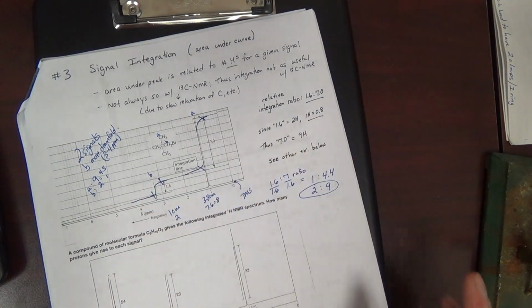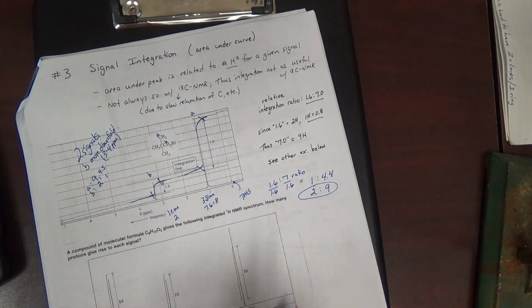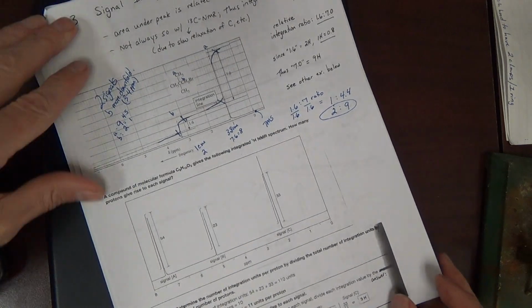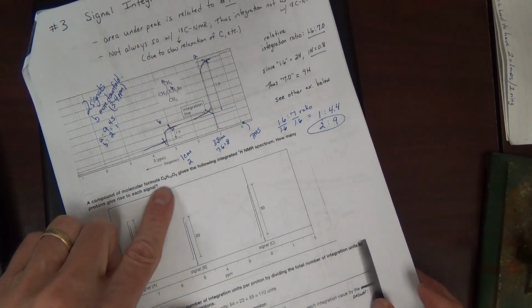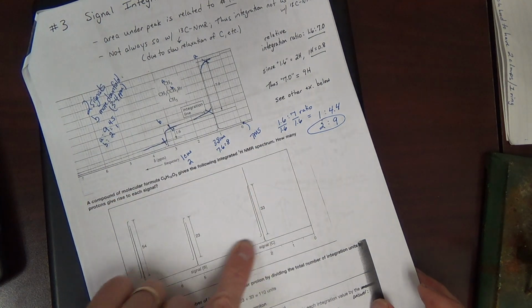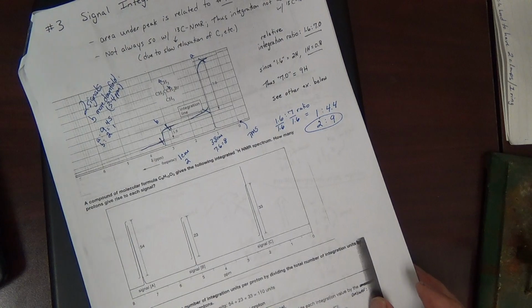Now that was an intro to integration. As we go along, we will do more and we'll approach it differently and try to fill in the blanks here. Now there's a problem here to work. A compound of molecular formula this gives the following NMR spectrum, which is integrated. How many protons give rise to each signal?